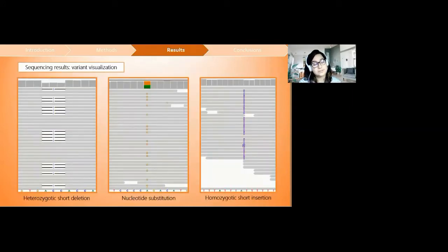The overall results show that the causal gene and variant from each diagnosis was correctly prioritized by the software in 44 cases out of 62 cases in total. This is probably because their causal variants were correctly captured through a high number of reads, which we call coverage.